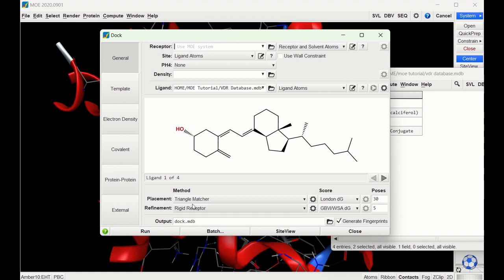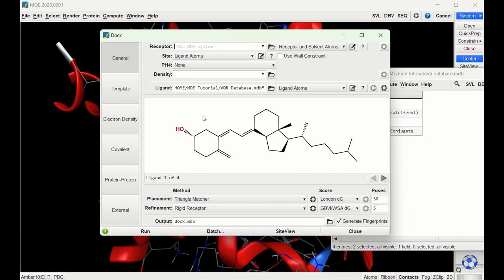We can leave the Triangle Matcher as is but change the number of poses. MOE is basically going to throw these ligands into the receptor and create different hydrogen bond interactions or other interactions to try to find the best pose — the best configuration that gives these ligands the best binding. By setting the number of poses to 50, MOE will try 50 configurations and find the best one.